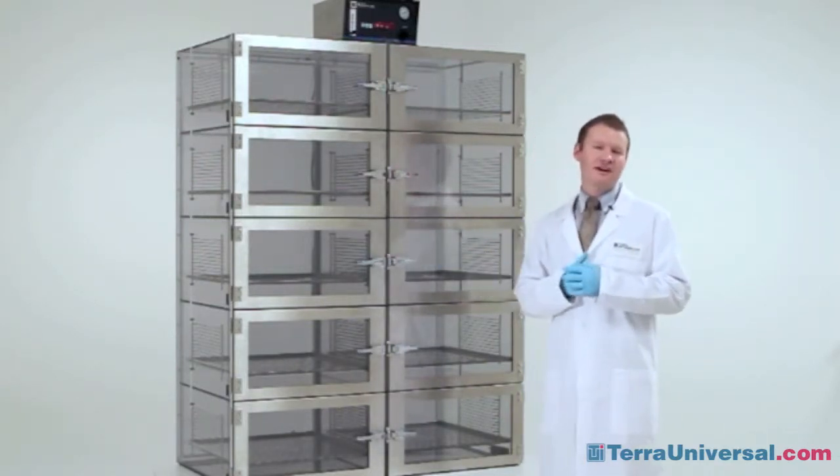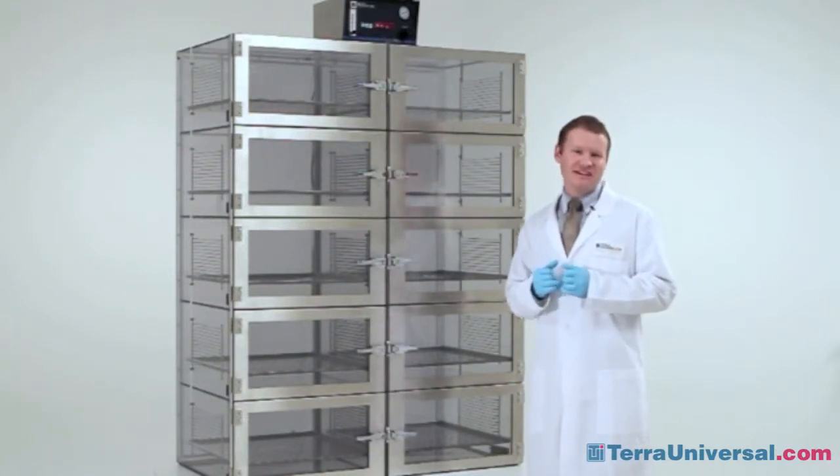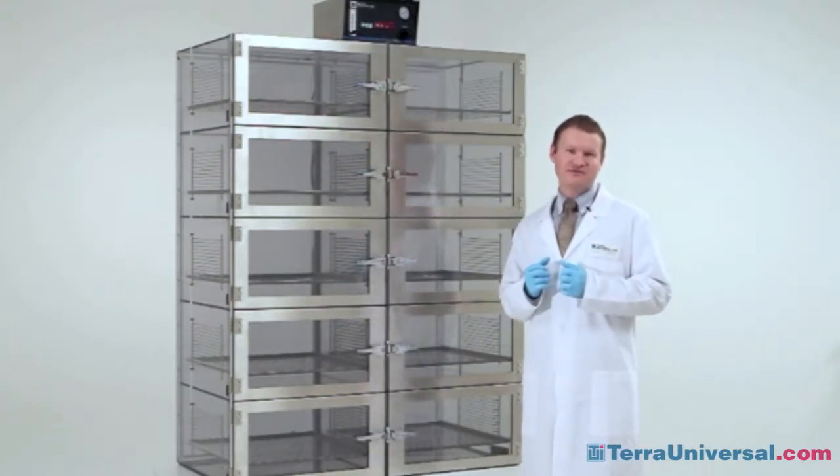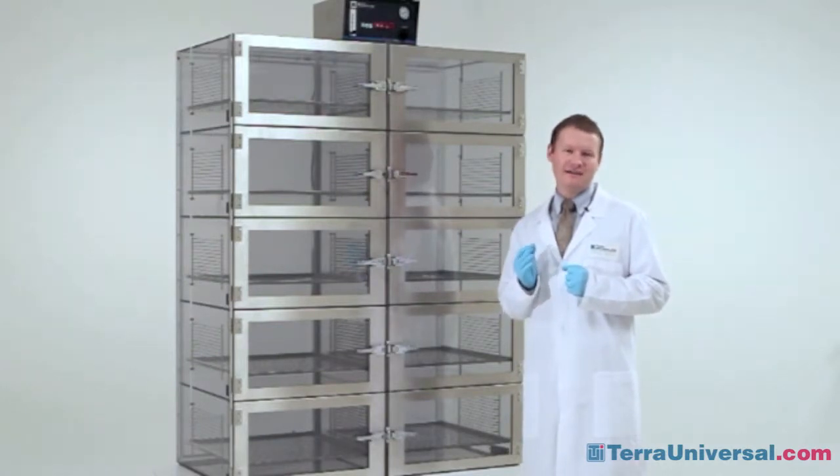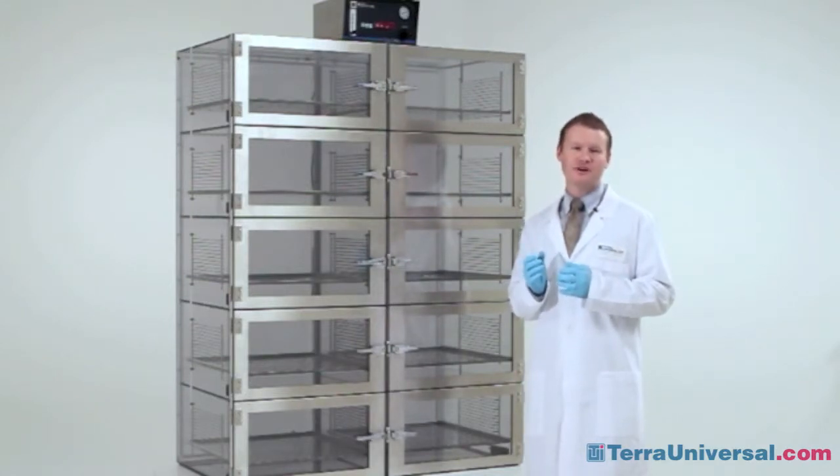Now for users that need dry storage systems fabricated of a very high, chemically resistant, rigid material, we can compose our chambers of 304 grade or 316 grade stainless steel.